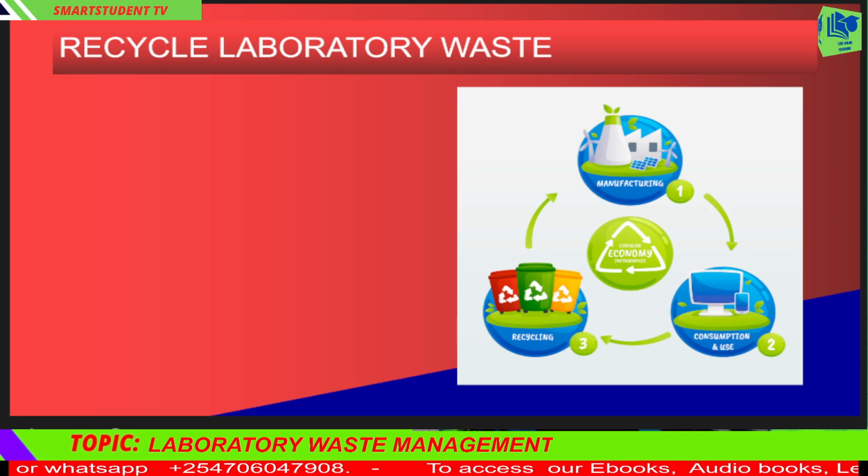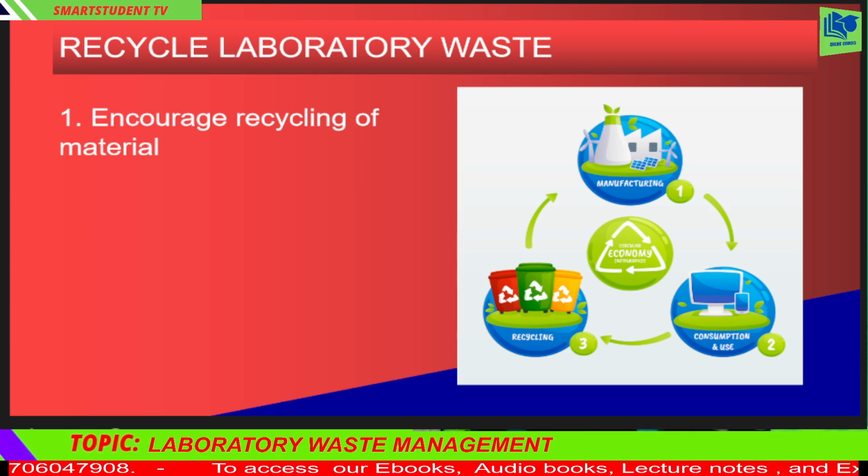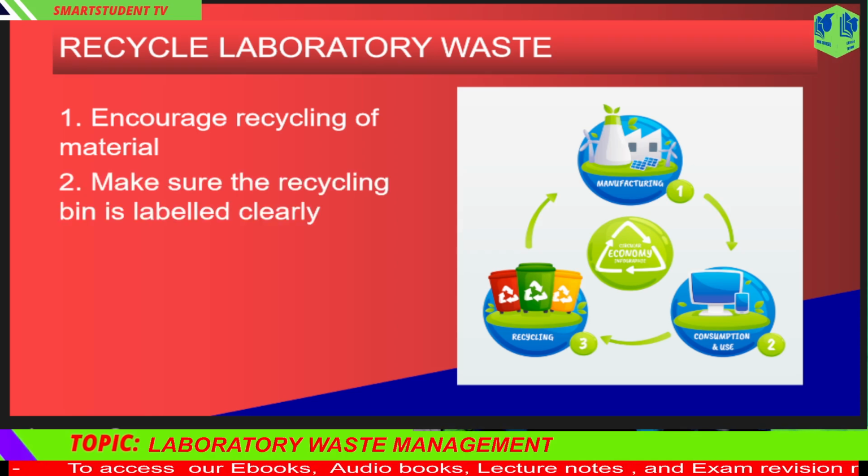1. Non-hazardous waste such as paper and packaging waste can be recycled. To promote and encourage recycling of this material, place recycling bins in the lab. 2. Make sure the recycling bin is labeled clearly by placing a label on the bin stating paper only, ensuring that hazardous wastes such as chemicals are not placed in the bin.